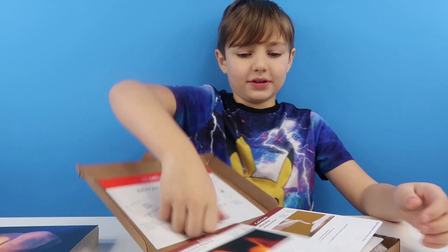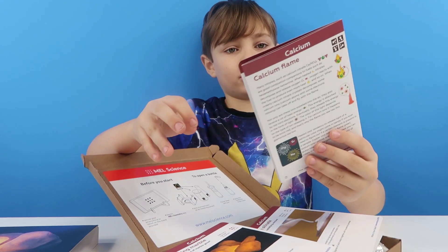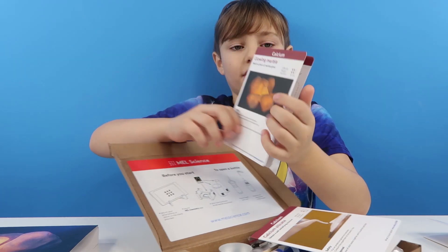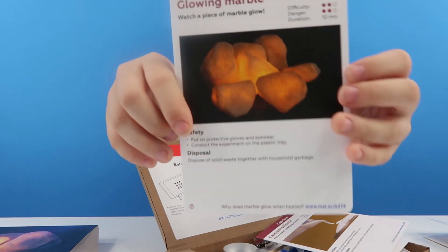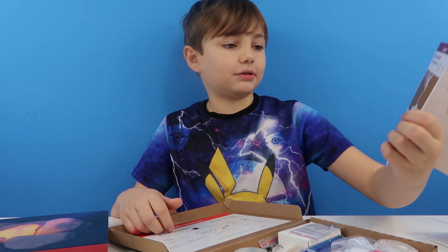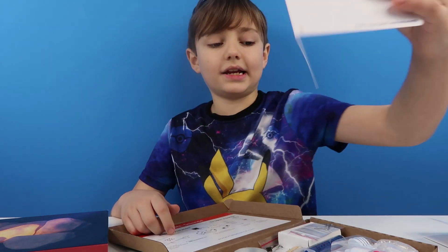So, open! It looks like this one's Calcium Flame — we might be doing that on another video. Here's Glowing Marble — that looks cool doesn't it. And we are also going to be doing Calcium Silicate — that looks cool as well.